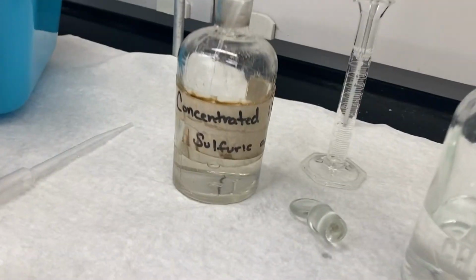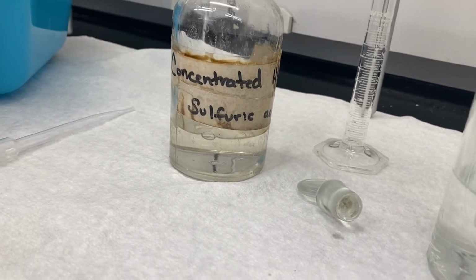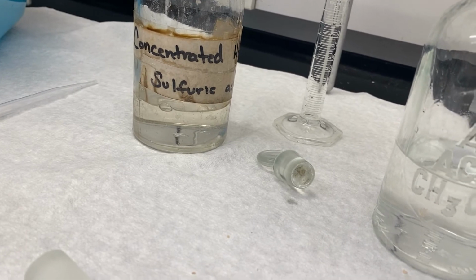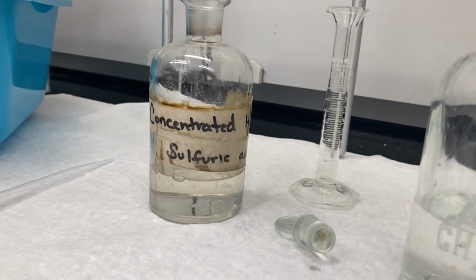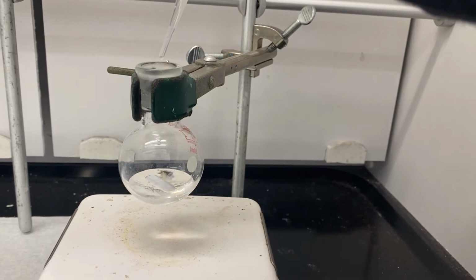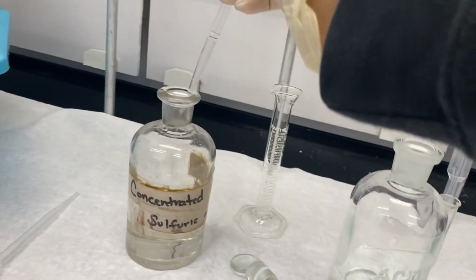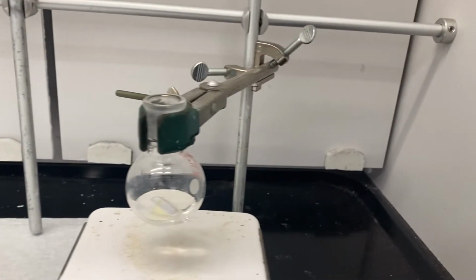And we're going to add our sulfuric acid catalyst, and it says add about 0.25 milliliters. If you think about it, that's about a quarter of a milliliter. And I'm just going to use the rule of thumb that there's approximately 20 drops to 1 milliliter. So a quarter of 20, we'll just add 5 drops to our solution. And this is catalytic, so it will be turned over in the reaction.